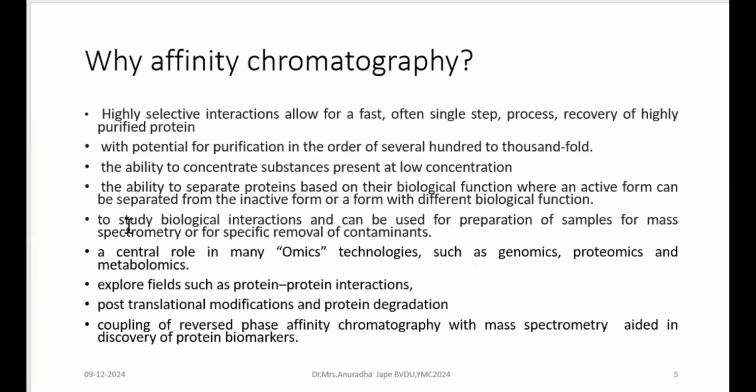You are aware of antigen antibody specificity, how crucial it is when an antigen is to be tapped, or a virus is to be purified or attacked. The body has a lock and key mechanism, where selective functional groups interact. These kinds of interactions are very sensitive to ionic environment, the pH, etc. So why go for it?